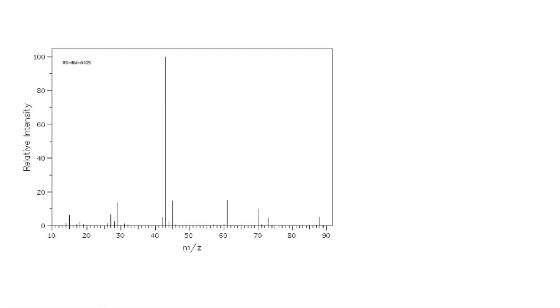That is the one that has the highest mass. You might see this little peak down here, right near the end of the spectrum, and you can actually count along that scale and work out that that peak is at 88. The other peak that is important is the tallest one, which sometimes is the highest mass, but usually not.